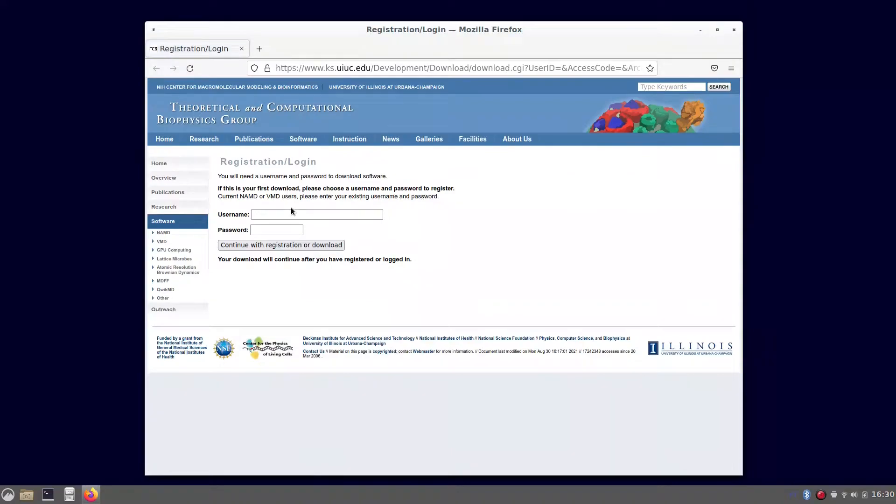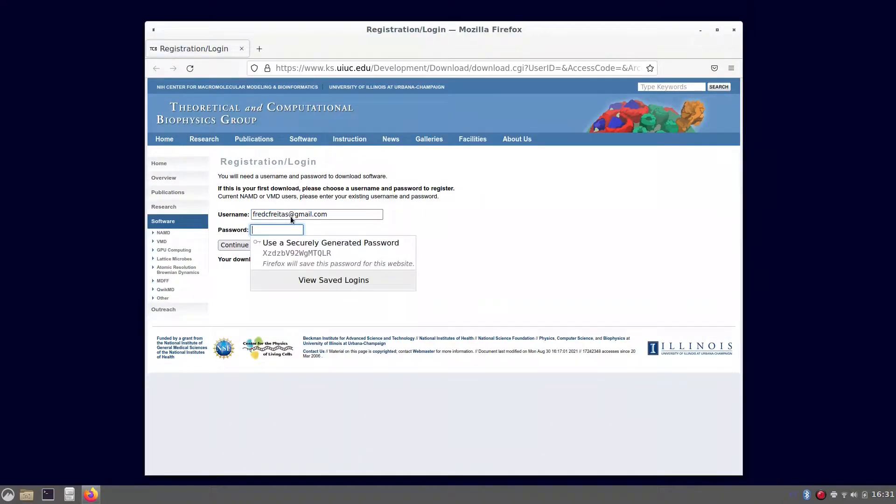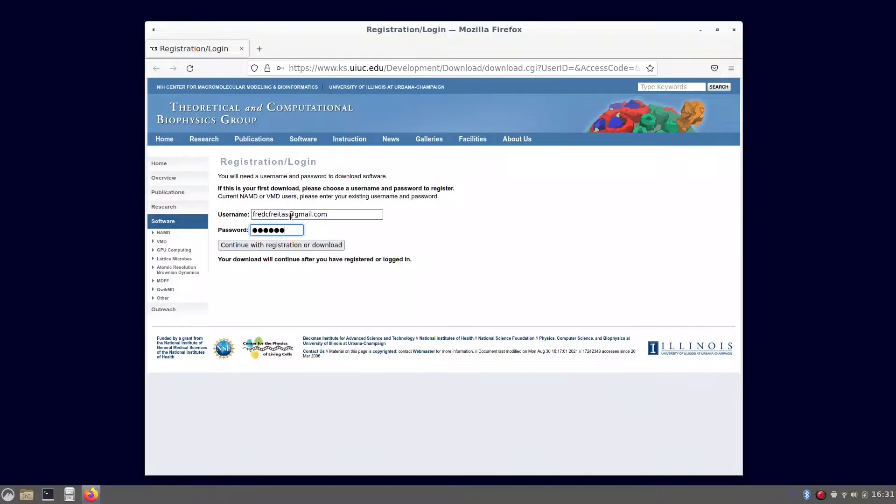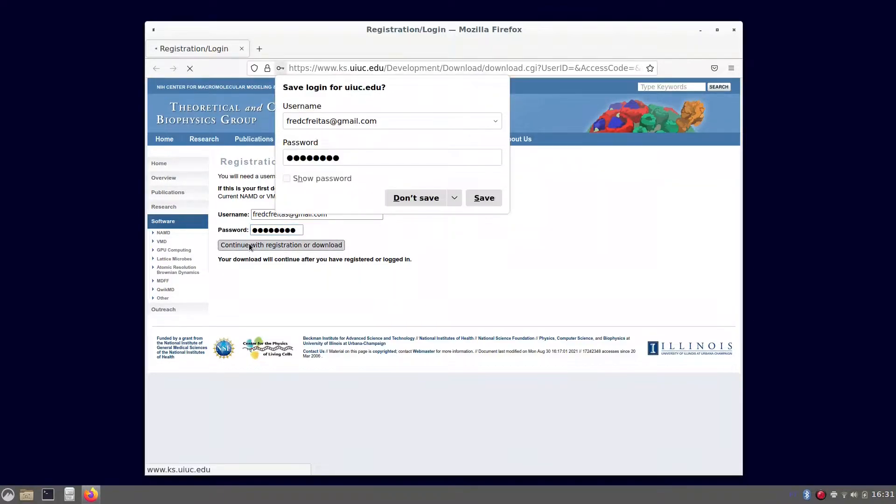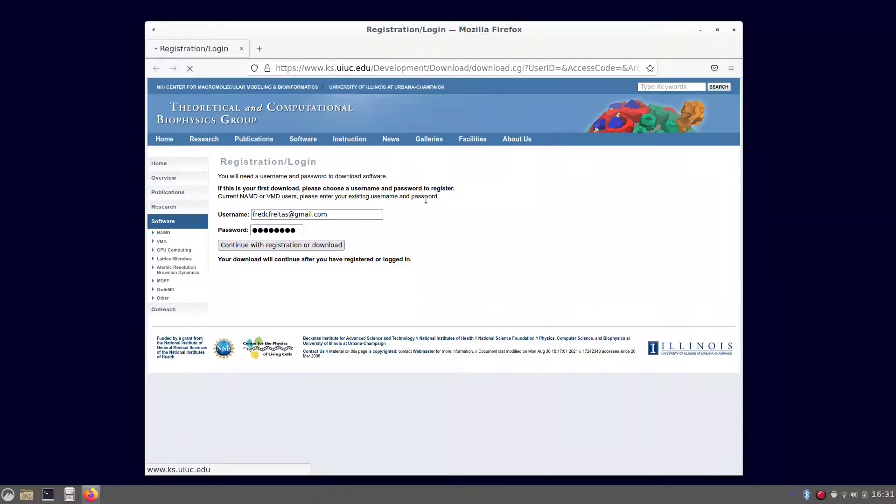If you have done that before, you have to give your credentials, your username and password. If you have not, you have to register yourself at this point to get the actual download link.